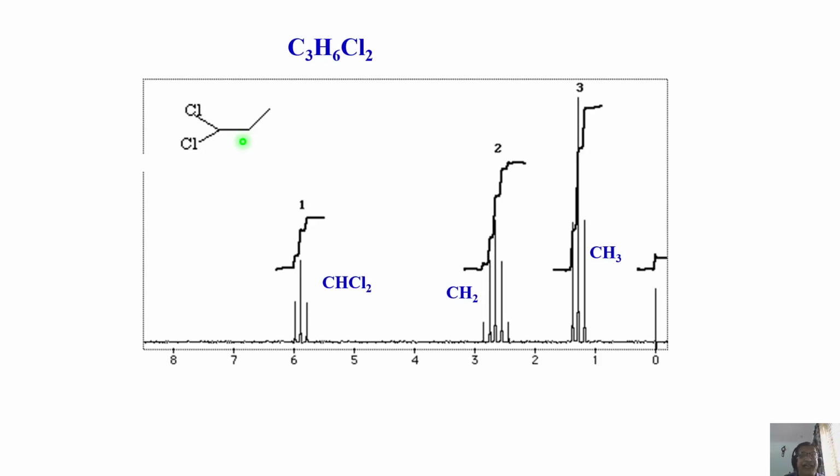But in reality, it is going to overlap. It is not distinctly different coupling, because if the couplings were very much different, you would have got that distinctly different pattern: a small doublet, a big doublet, and a small doublet of the same ratio. But now there is an overlap of peaks. As a consequence, each line of the quartet split into a doublet which will overlap and gives a pentet pattern. Please recollect what I said about the pentet multiplicity pattern. So it is a pentet pattern.